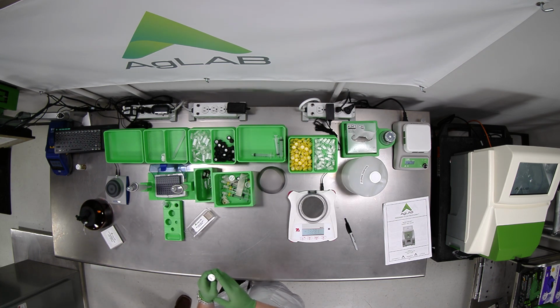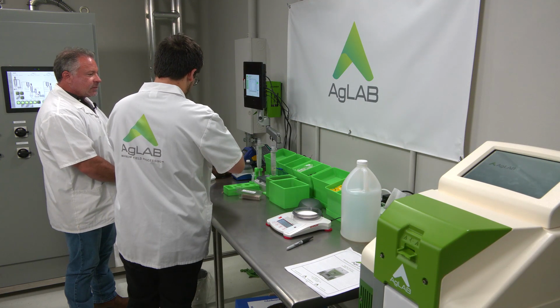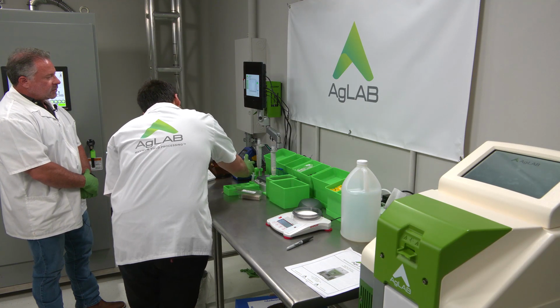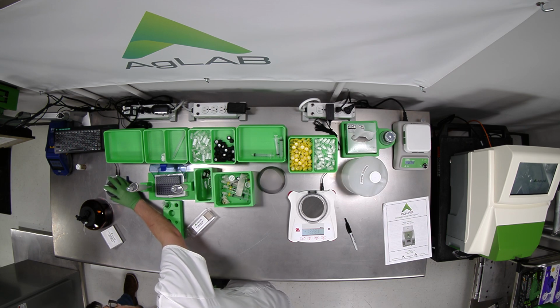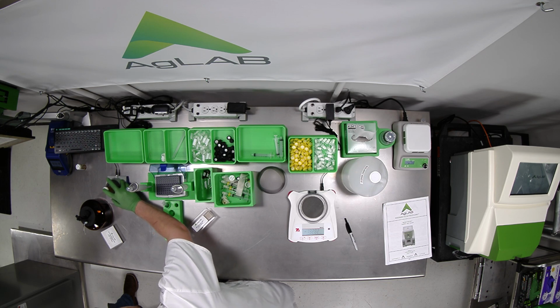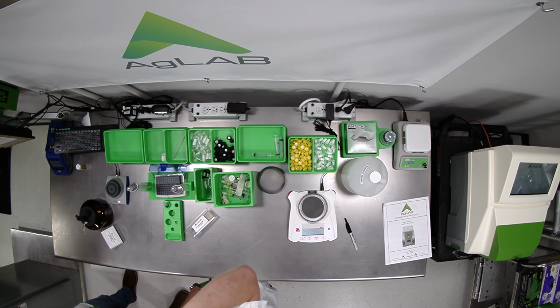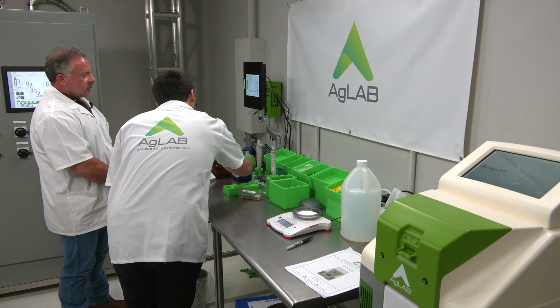All right. So sample prep is very similar in both cases. Another difference that you'll see is that stage 2 residue takes a lot more agitation to go into solution. It likes to stick onto the side of the glass. So I would start by shaking it for about 30 seconds or so, but you're really going to need to stop and visually inspect the vial to make sure that you don't have any big chunks that have not gone into solution.